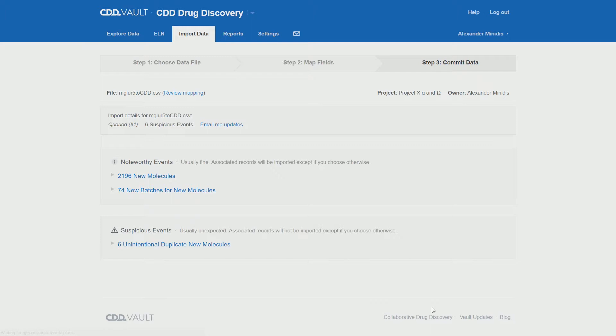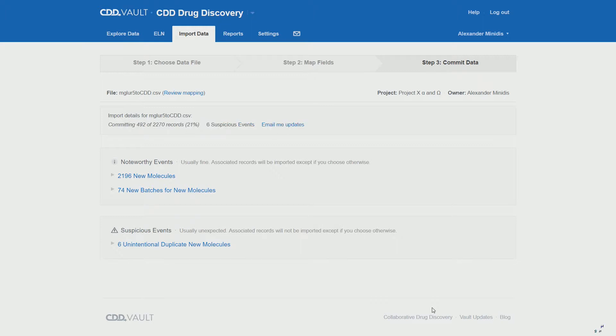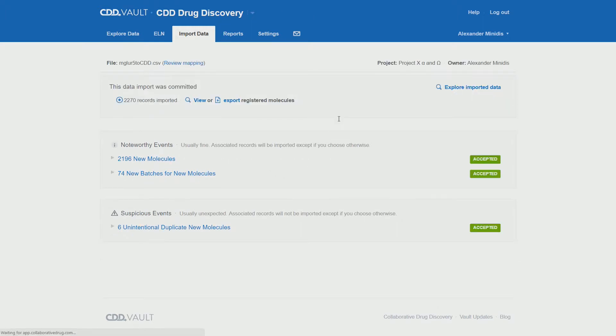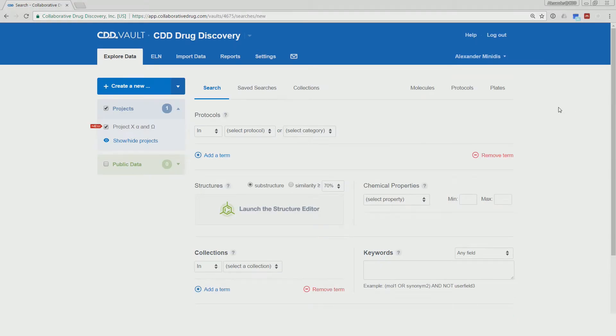Here again this might take some time for the system to process your file depending on the size. You can again have the system email you when it's done. For the purpose of this tutorial I will be using a fast forward in the video. Once the import is done, you would normally explore the imported data, but in this case we can skip this and go directly to the next topic of this tutorial: creating a protocol and importing associated data.